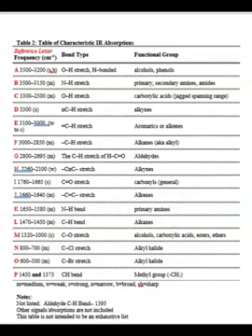So again, this is the entire table, and we won't use all of these. There are some that we just don't see very often, but a lot of these are very important, and so they will keep coming up again and again. Some of the ones that we won't see very often probably are this triple bond stretch for alkynes, and some of these primary amines. We don't really have too many amine examples, at least in high school version of organic chem. You'll certainly see them in college chem.